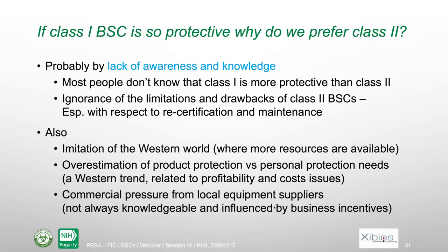And also the last thing is that there is some commercial pressure from local equipment suppliers, and that's true for Pakistan. They are not always knowledgeable about the difference between the types of cabinets, and also they are clearly influenced by some business incentives. They will be pushed to sell you first the cabinets that are the easiest to sell, that are the most manufactured, and also perhaps the more expensive, because the commission will be better and so on. So clearly, you should not only trust your suppliers in this aspect. You should challenge them, but not blindly trust them.